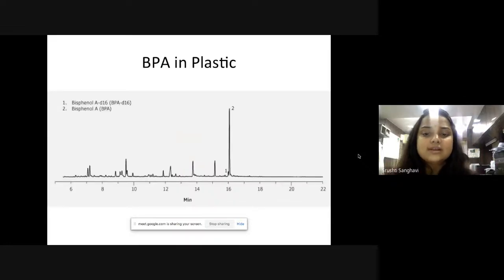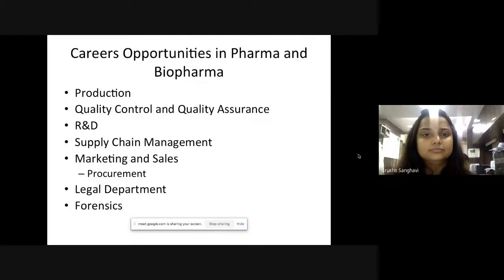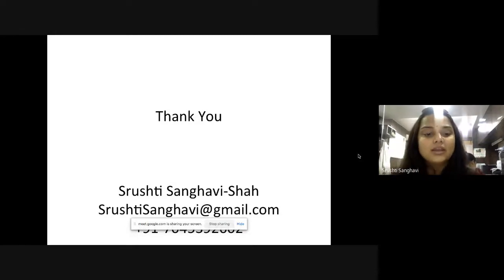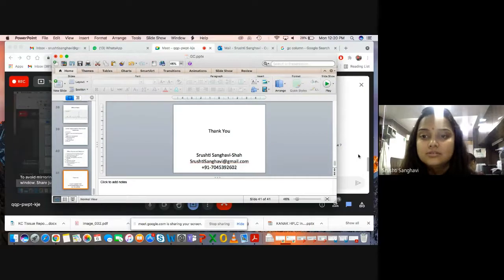So this is an example that we see on our screen. A high quantity of BPA, bisphenol A, was found in plastic containers using gas chromatography. Okay, this is where I conclude what I wanted to talk about.